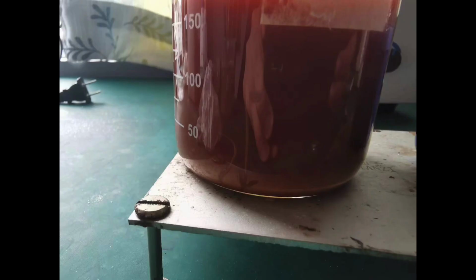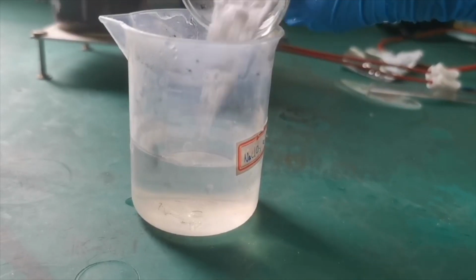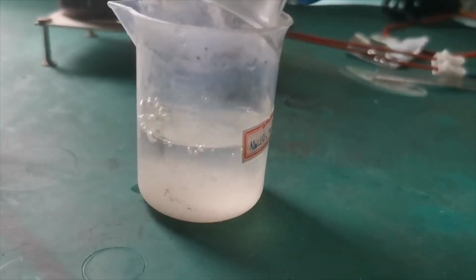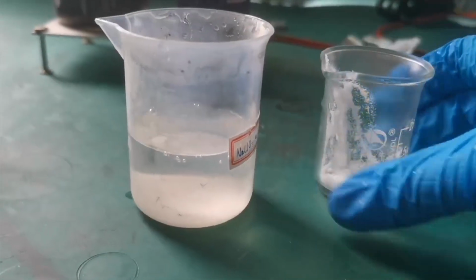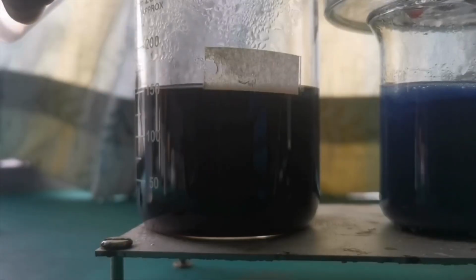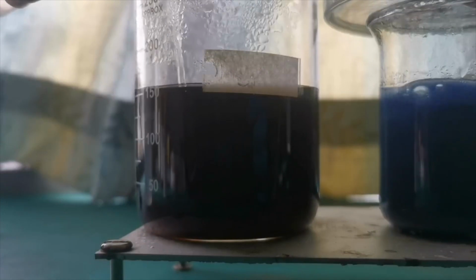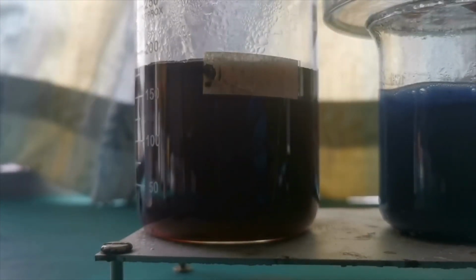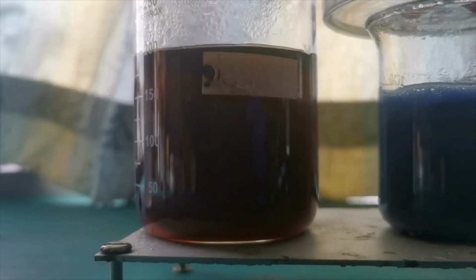Meanwhile, the acetate solution has finished filtering, and I can start the lanthanide separation step. As I just mentioned, the step requires sodium and sulfate ions, so I weighed out around 14 grams of anhydrous sodium sulfate, dissolved it in some hot water, and added it to the solution. Nothing apparently happened, but as I boiled the solution again, the solution became murky and some precipitates appeared.